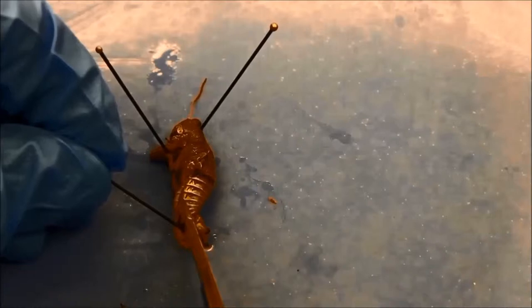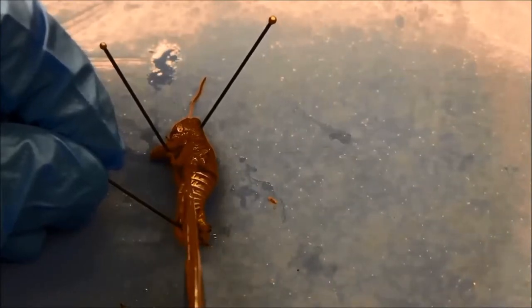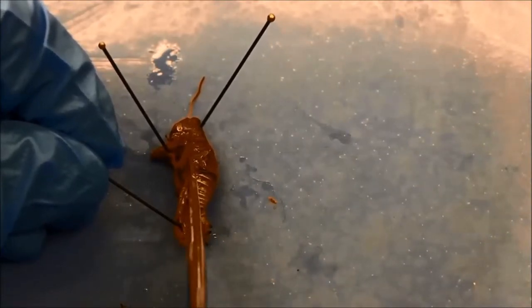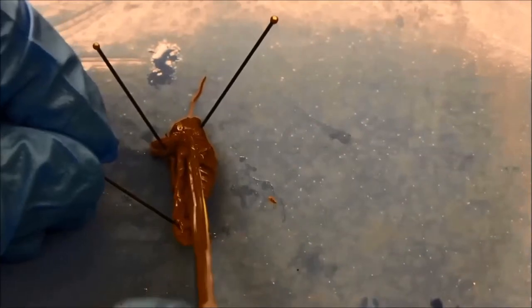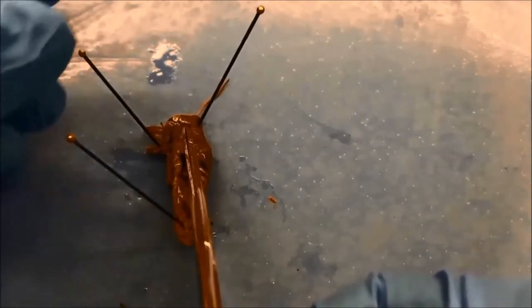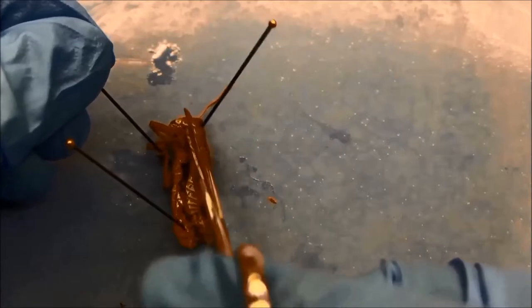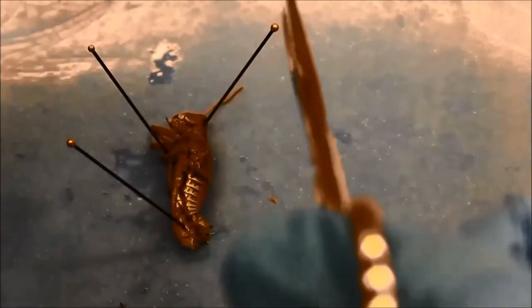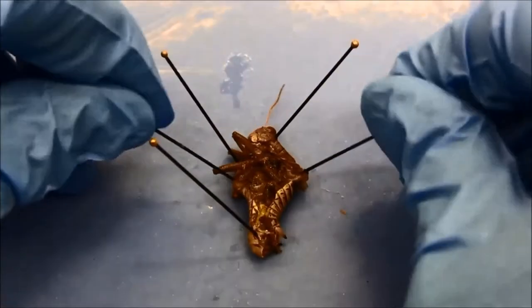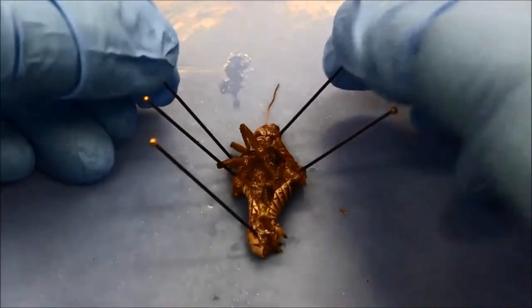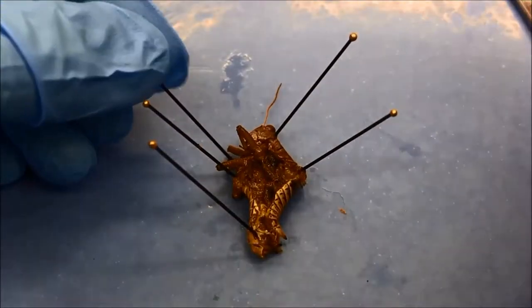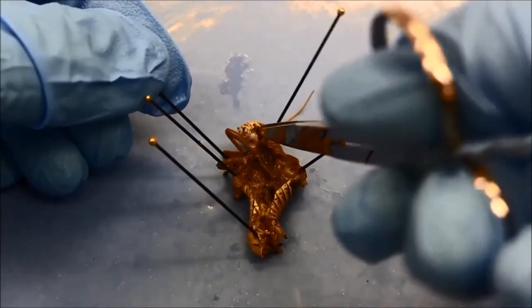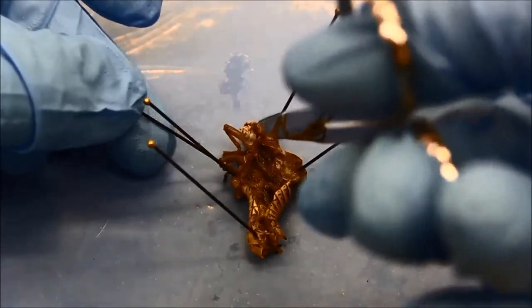Then I use scissors to cut the exoskeleton of the grasshopper along the side. I start with the last segment of the abdomen and move slowly towards the head. I open the internal cavity so that I can see the digestive system. You can also make an additional cut if needed.